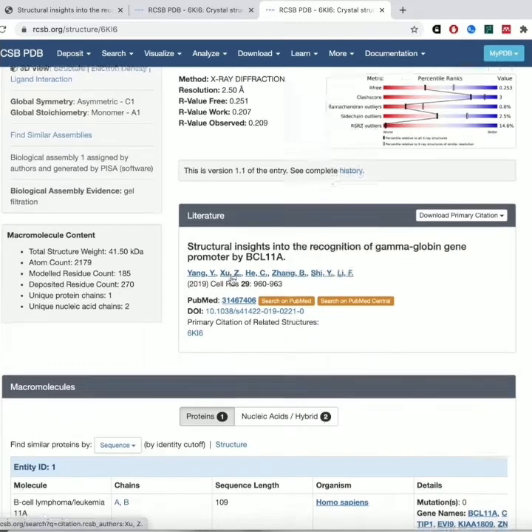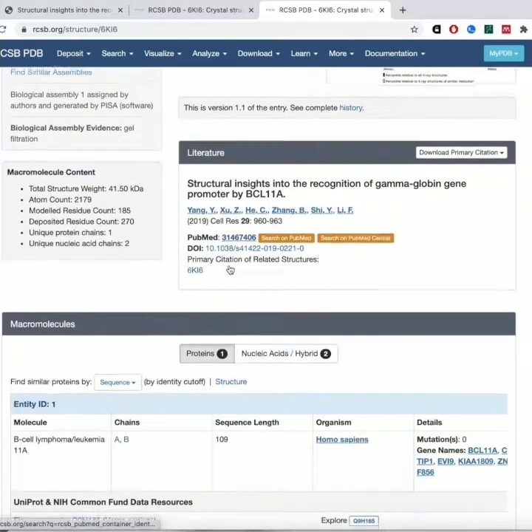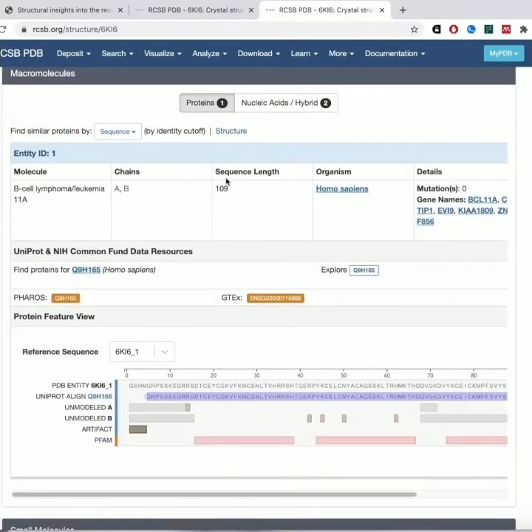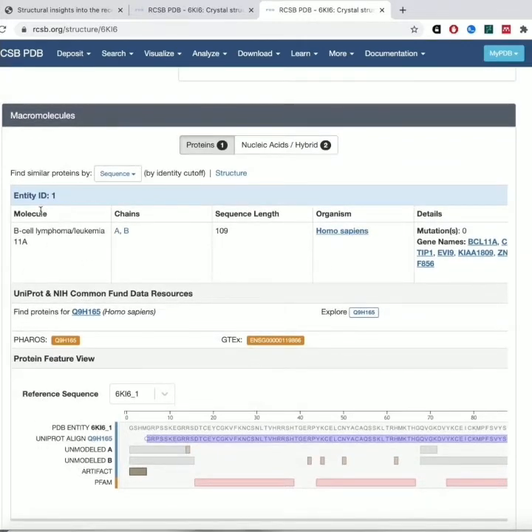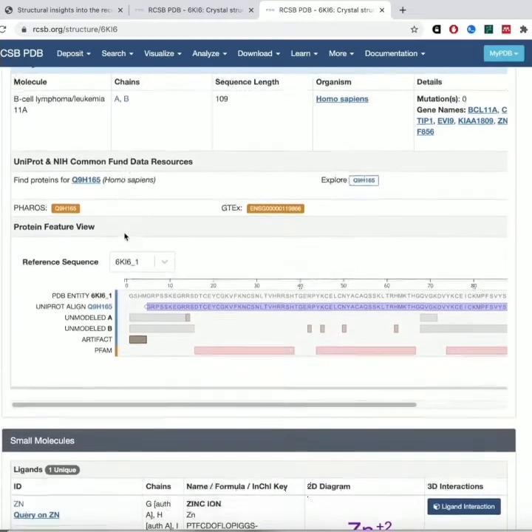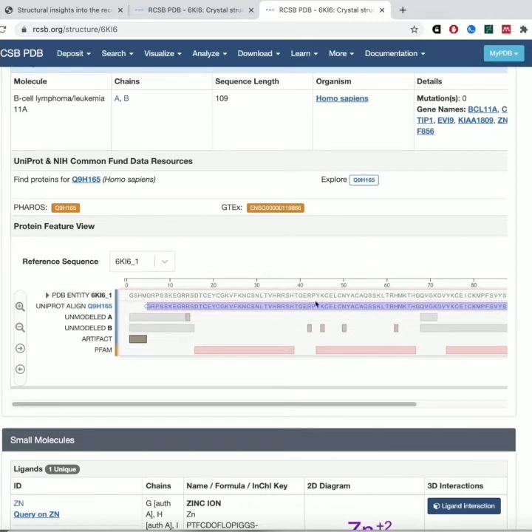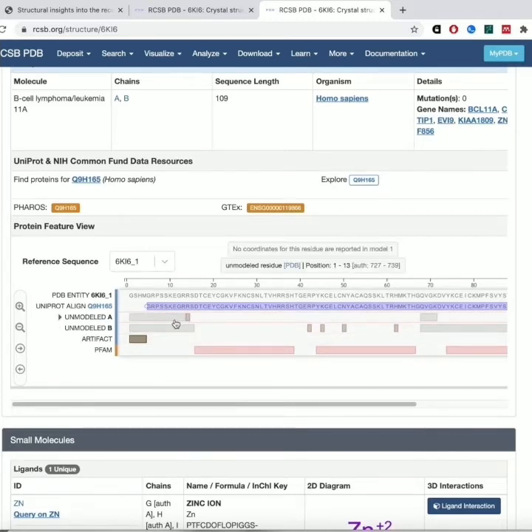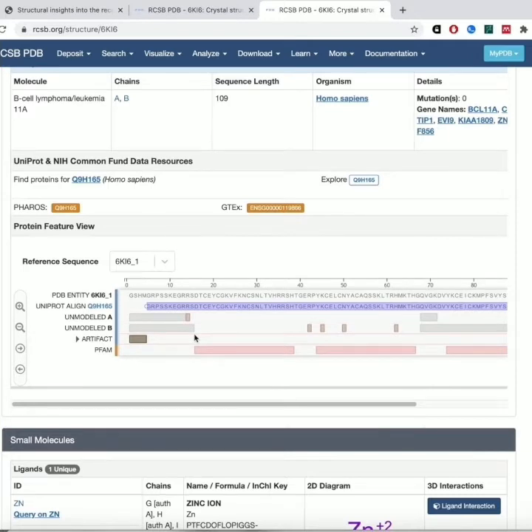It gives you the information for the associated paper, as well as a list of what is in the structure. So you can see the molecule — this is the B cell lymphoma leukemia 11a, so that's BCL11a that we were talking about before. It has two chains — those are just different copies of the same protein. Then there's the protein feature view showing the sequence of the protein. The gray regions are unmodeled — that region shows up as a dotted line because the data for that region wasn't strong enough to actually model it in.